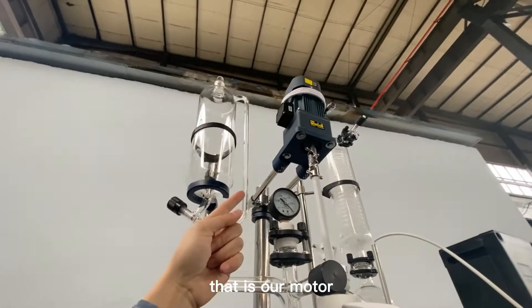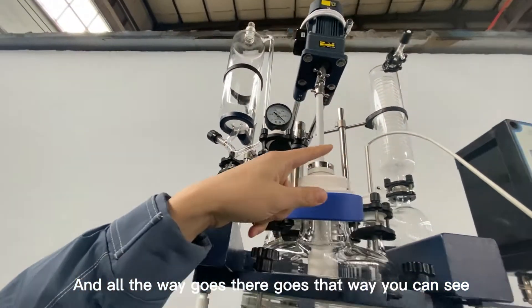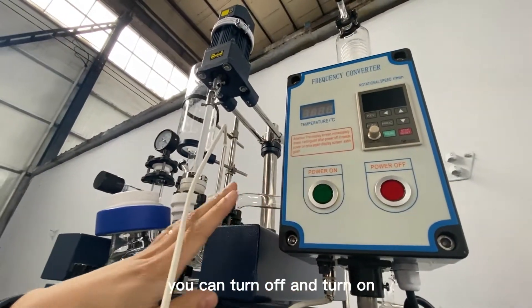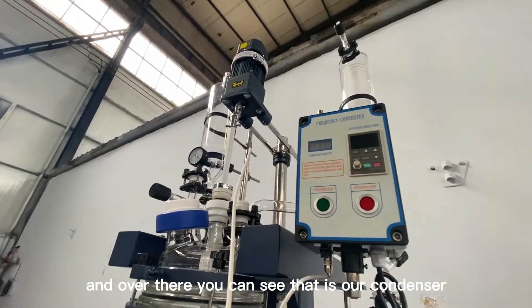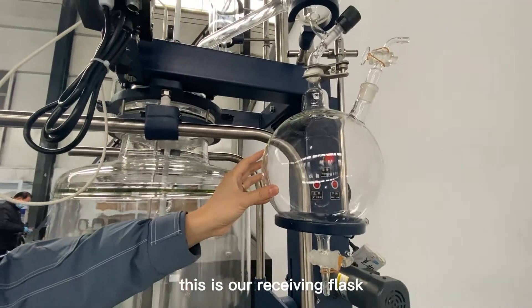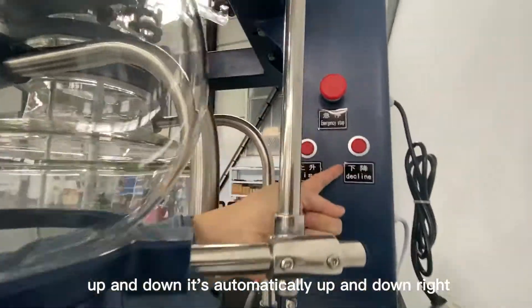Over there is our motor, and this is our vacuum gauge. You can see the control panel over there — there is a button where you can turn off and on, and also control the stirring speed. Over there you can see our condenser, and all the way at the bottom is our receiving flask. There is also a motor which can control the up and down movement automatically.